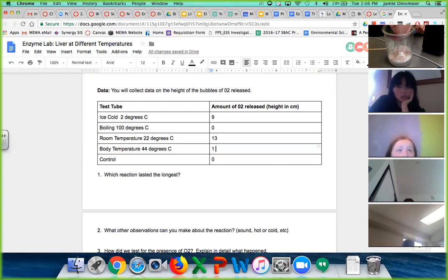Oh, I could see a little spark there. We'll see if we can get it a little bit better. It should completely reignite, which these sticks might not. I usually like to use the Starbucks wooden sticks personally because they, oddly enough, make really good embers. There we go. Got a tiny little ember. Nope. Oh, there we go. So the stick actually relit on fire. Ember.